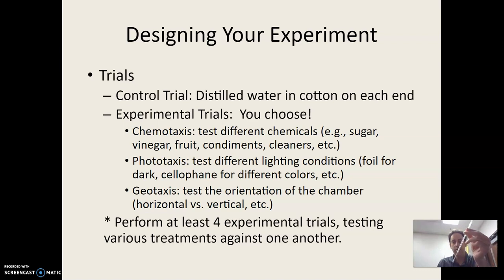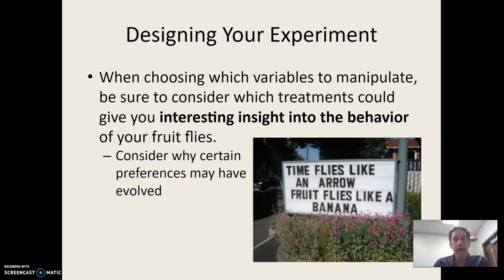Geotaxis, maybe you mount this thing at an angle or even vertically and see, do they care where they go? So you can be creative with this. Again, be sure you take good care of our fruit flies. But so long as you're not being cruel or unusual in your punishment of them, then you can have pretty much free rein.